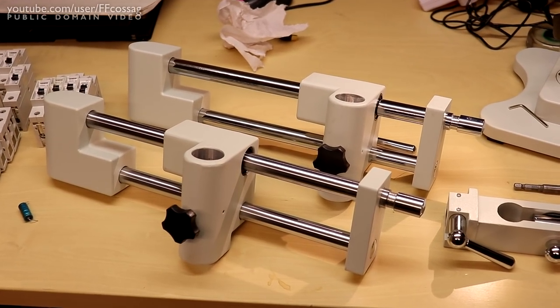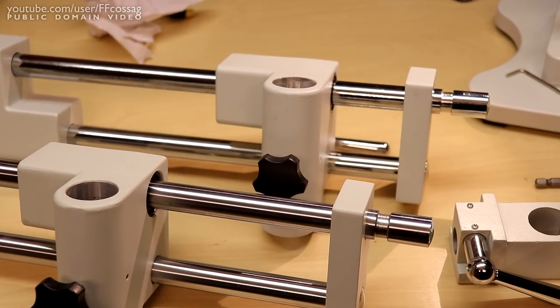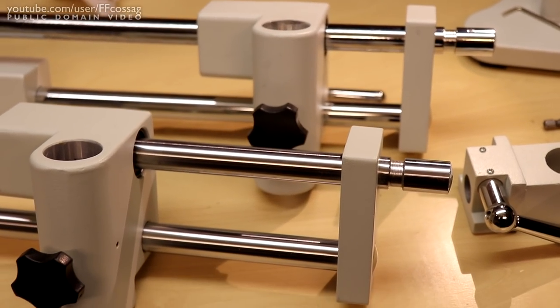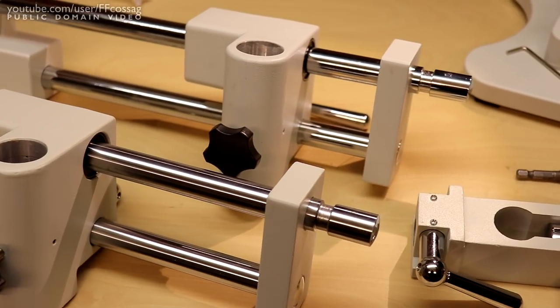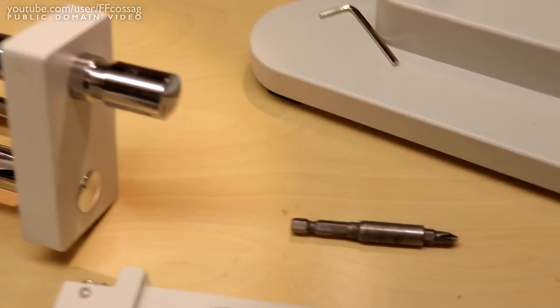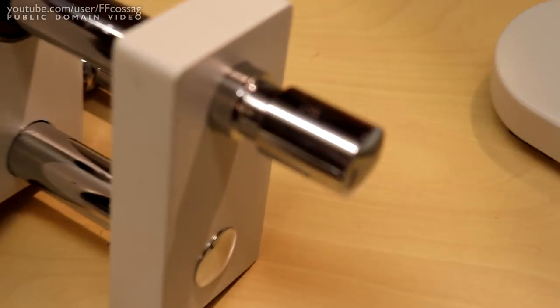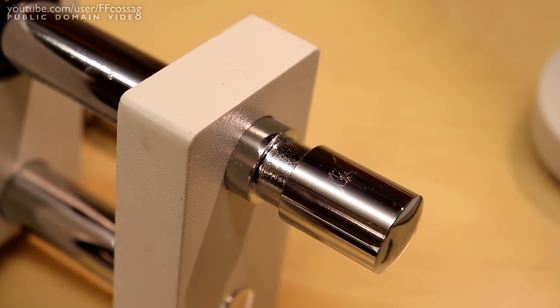Here we have the two rod iron assemblies side by side, and you can really see the difference in the shine of the top rod and the bottom rod. I can confirm they are using different materials. I took this normal screw bit and scratched up the end there, the old one. You can see the scratches quite clearly.